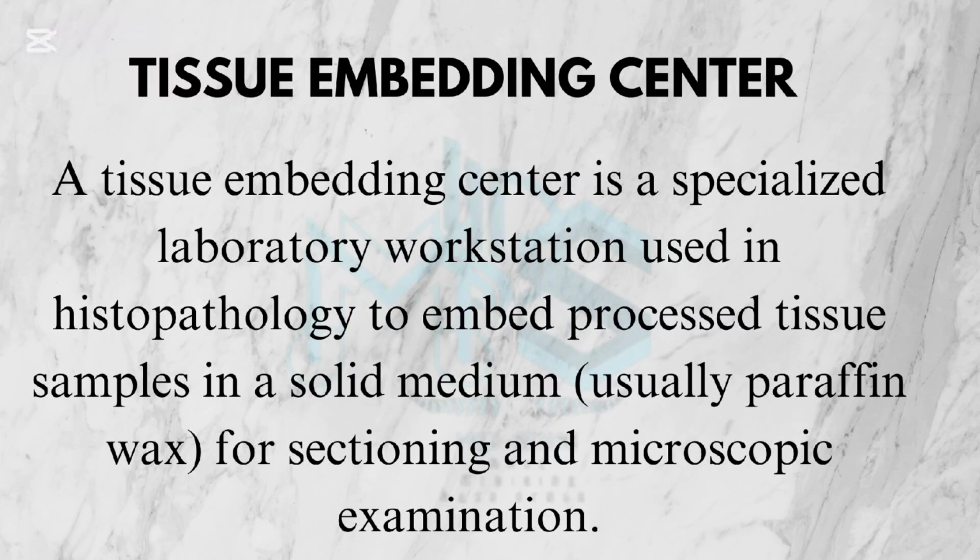The next on the list is a tissue embedding center. A tissue embedding center is a specialized laboratory workstation, because of how big this machine actually is, used to embed processed tissue samples in a solid medium, usually paraffin wax, for sectioning and microscopic examinations.